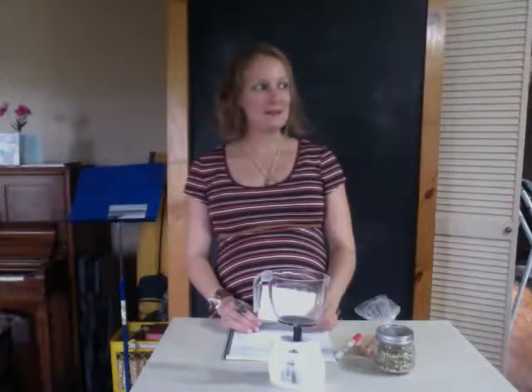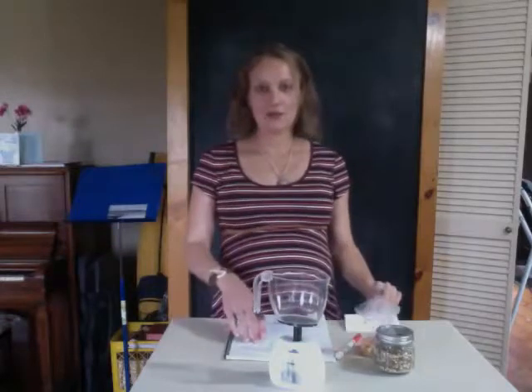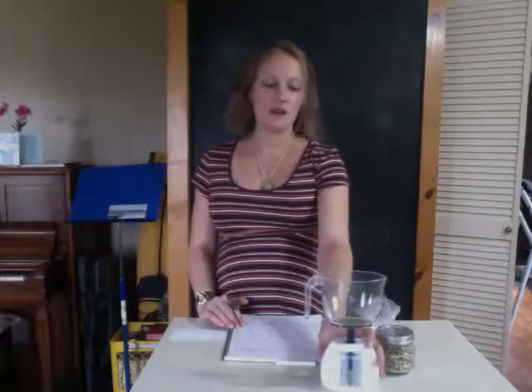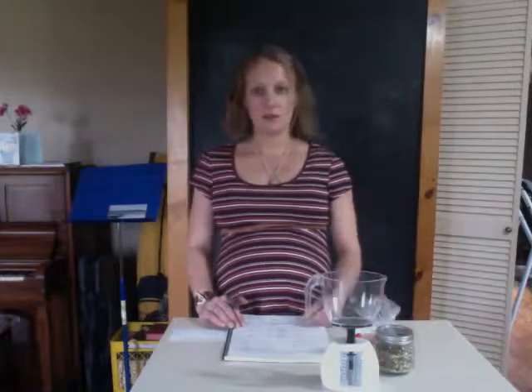Hello, so this is your first lab. I'm happy to be doing a chemistry lab online. I think this should be a lot of fun. Most of what we're doing here is very similar to what you would be doing if you were taking the in-person class. Actually, a lot of the activities can be done at home with some modifications to materials.